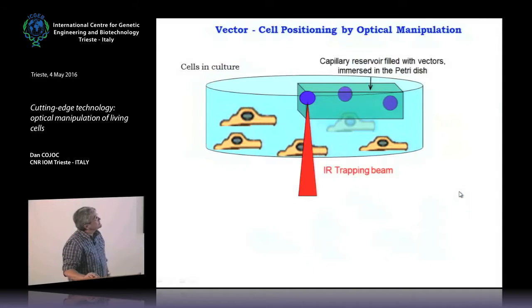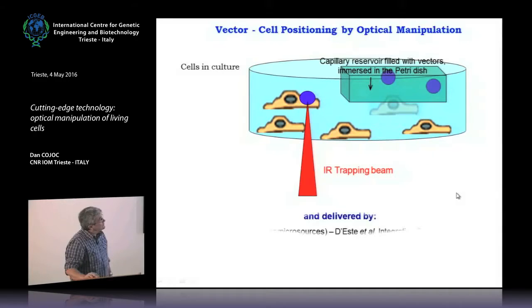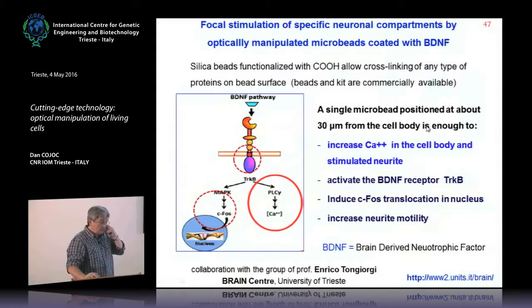So, how does it work? This is contact with beads, and this is with liposomes. You need a UV pulse to break the membrane of the liposome. And I will give you an example with microbeads.